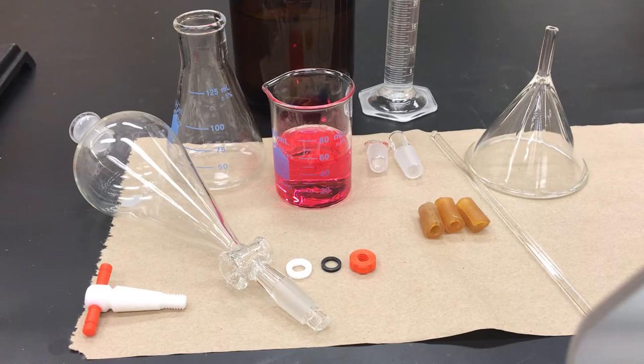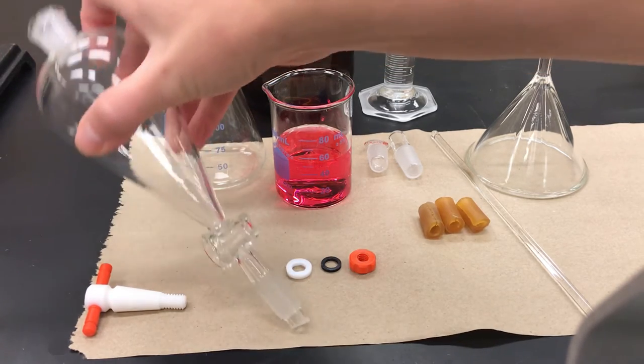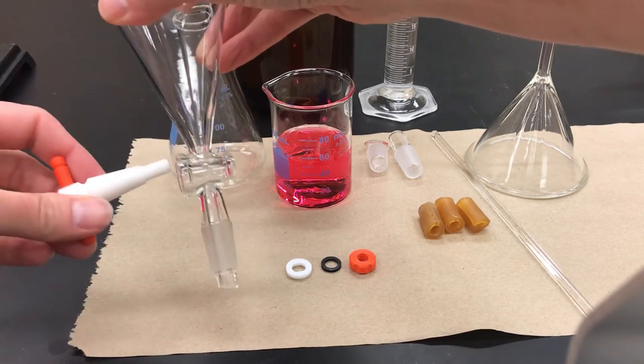Here are the materials I'm going to use. Separatory funnels are best stored disassembled — that makes sure that they dry fully after you've cleaned them, which means that you're going to have to put it together first.